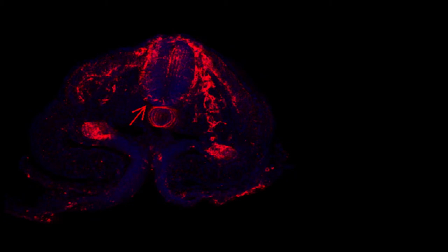Such thick vibratome sections can be scanned along the z-axis without interference from out of focus light, only with a confocal microscope.